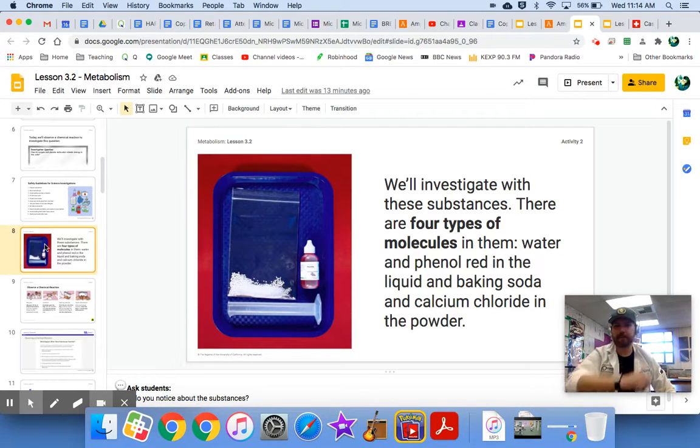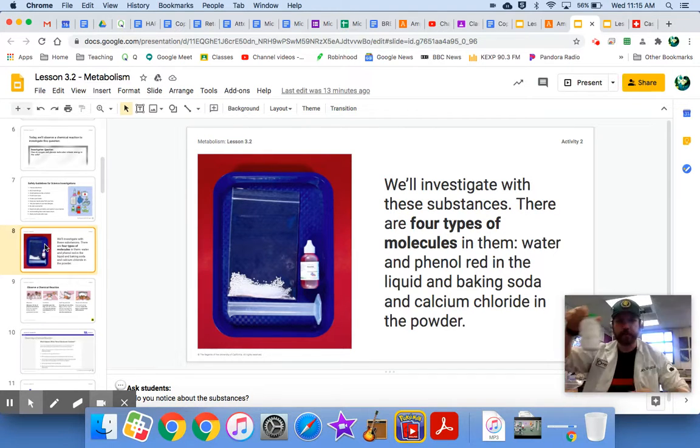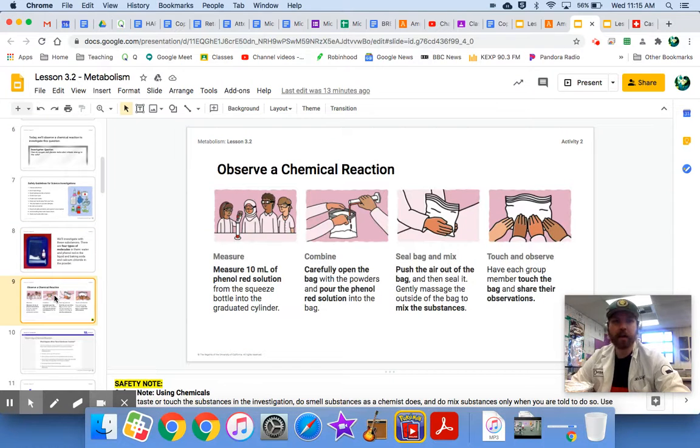Moving forward. We're investigating these substances you see right there. We have phenyl red. We have calcium chloride here, right here, calcium chloride. We have baking soda. There's our phenyl red. And what we are going to do is we're going to mix them all up.